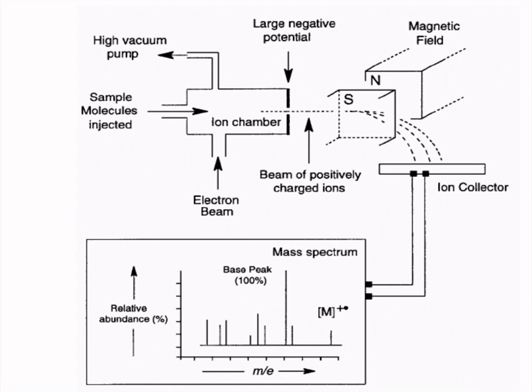The positive formed ions are accelerated under high voltage into a magnetic field, which is called the analyzer, and separated according to their mass over charge ratio, and ultimately strike the detector system, and a mass spectrum can be obtained.